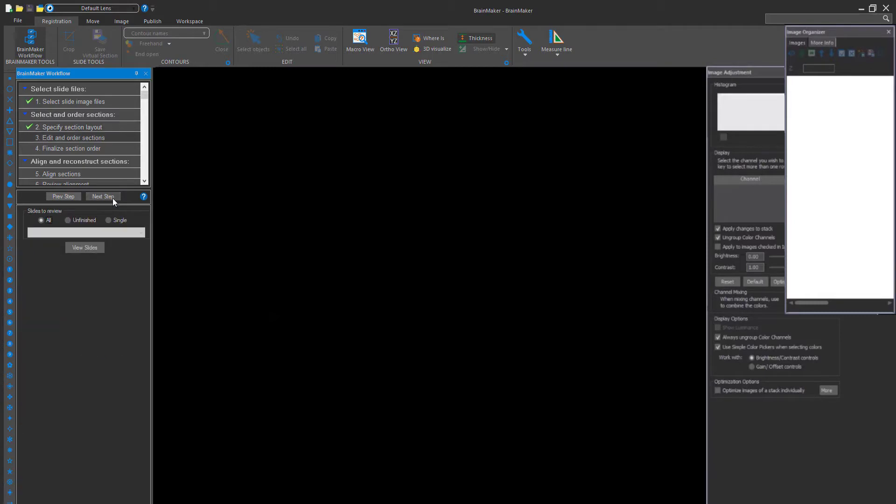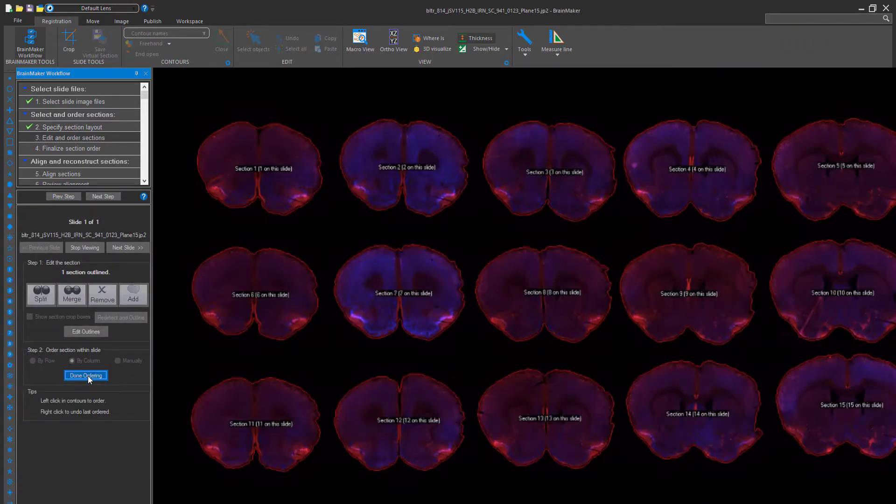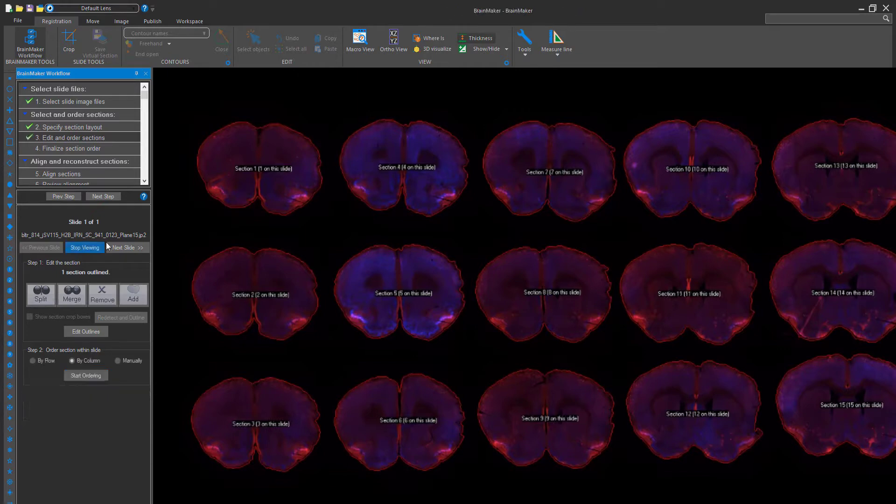After that is completed, click Next and the BrainMaker software will automatically outline and order your slides by rows or columns, preparing them for registration.